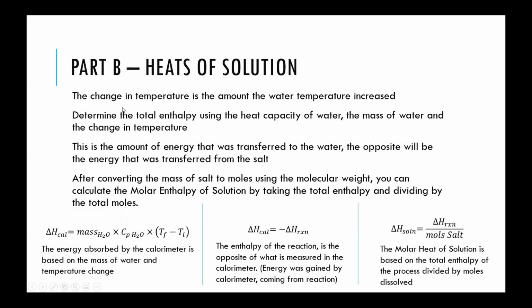To measure and calculate these heats of solution, you're taking first the total enthalpy that was absorbed by the calorimeter. This is the enthalpy using the mass of water, the heat capacity of water, and the overall change in temperature. This gives you the total numerical value of the heat that's being released.